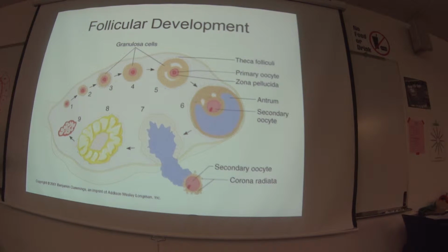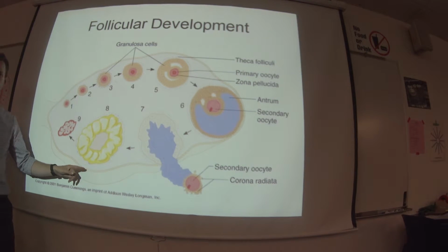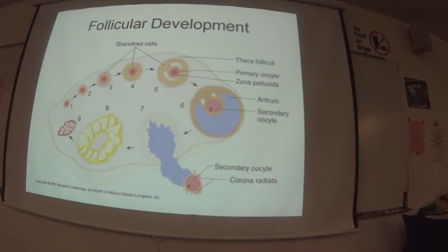Then ovulation happens. And the end of this story is the follicle actually turning into a really powerful endocrine tissue. That's called the corpus luteum. It means yellow body because in reality, if you look at it in an unstained organ, it is quite yellow. When it's stained, it's kind of pink, so under a microscope, it won't actually be yellow. But this is what secretes progesterone. You don't need to know any of the hormone stuff.